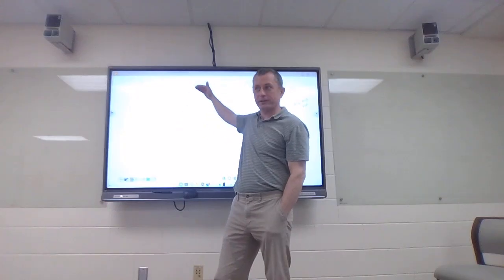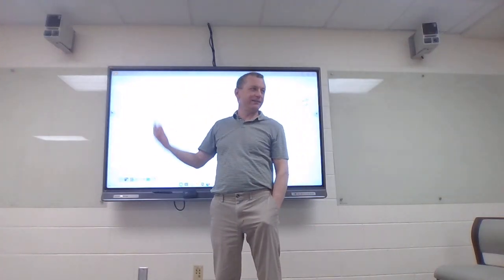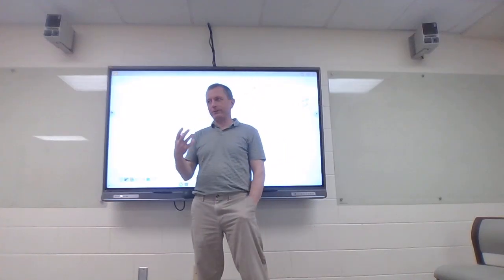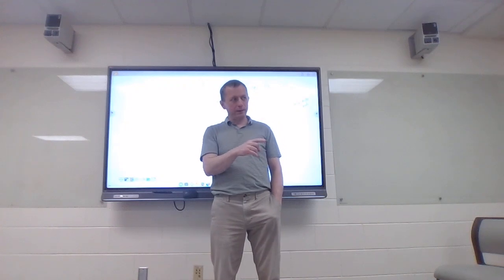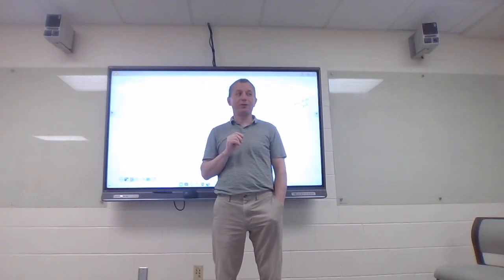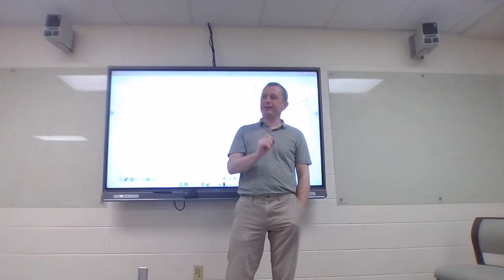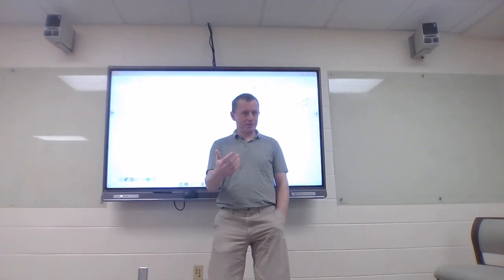So it's better if I just kind of walk you through it, show you what it looks like, and then go from there. If we have time, hopefully I have time, at the end of this, we're going to go into the lab, and I have a bunch of samples that all they have on them is a molecular formula, and you can take an IR and an NMR of that sample, get that experience.